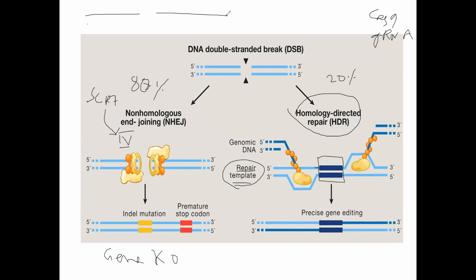Now what you do is take 1000 base pairs from here, and 1000 base pairs from here, and this sequence you graft. So this is the supposed region of cut. Either side, 1000 base pairs you take, and then you put your gene of interest in between. This gene will be inserted, knocked in.